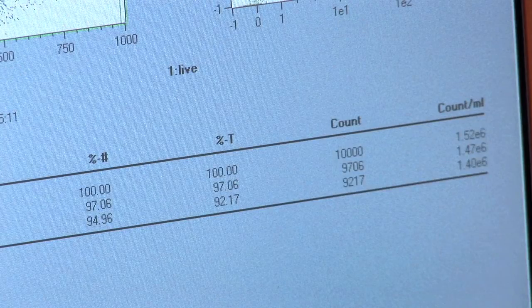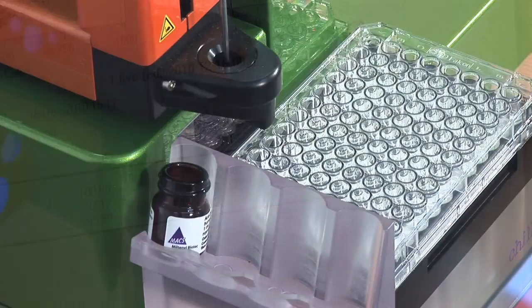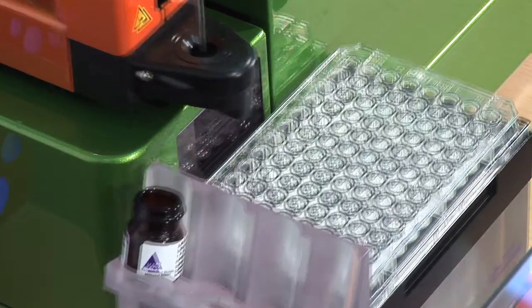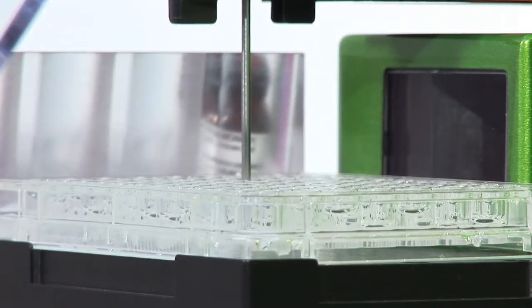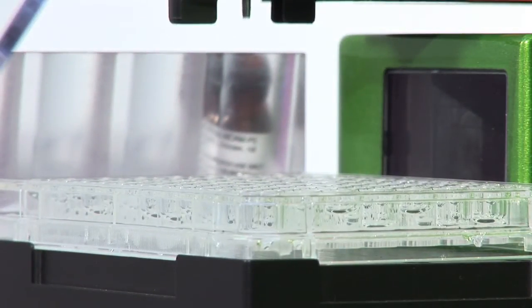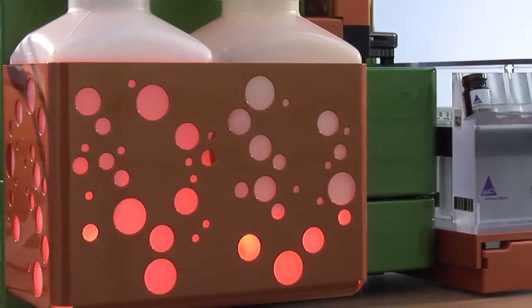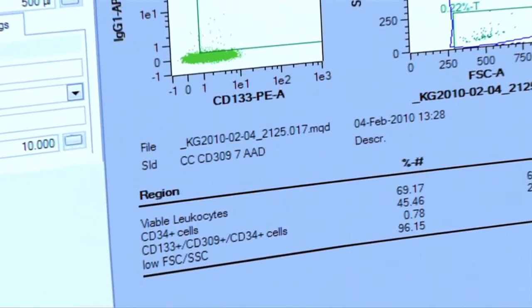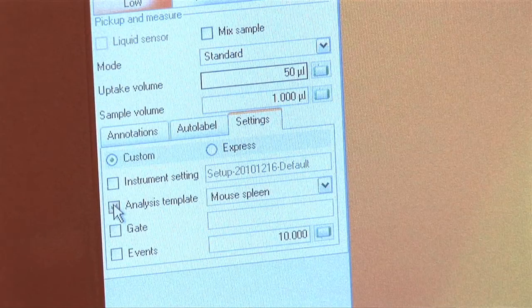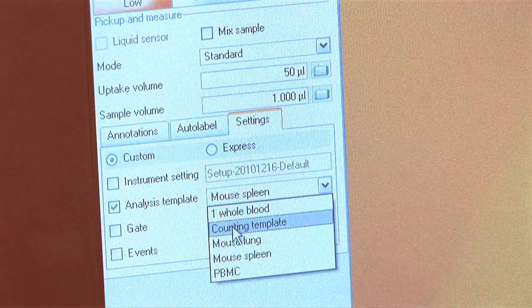Enjoy the convenience of walkaway sample processing of up to 96 samples in a single run. Get deeper insight into your research with highly sensitive rare cell analysis at the click of a button.